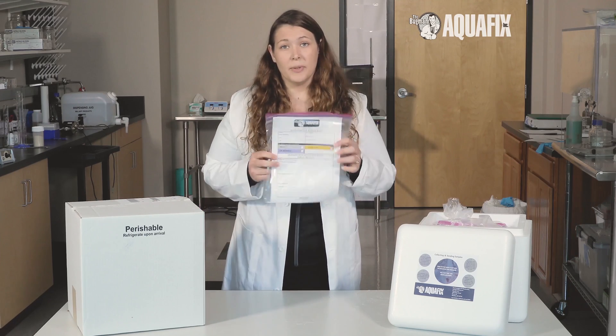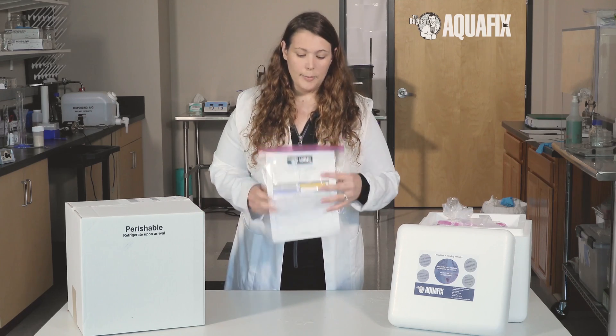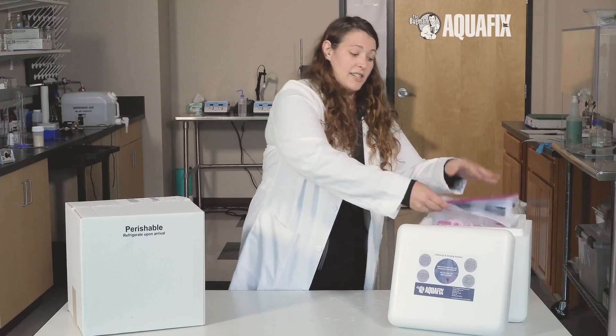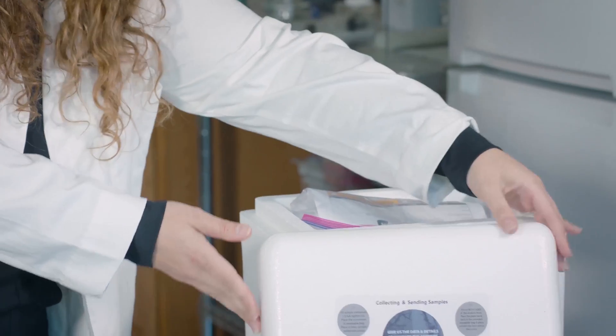Fill out the analysis form completely and return it to the resealable bag, making sure that it is sealed shut. Place the analysis form atop the sealed liner bag and return the cooler lid.